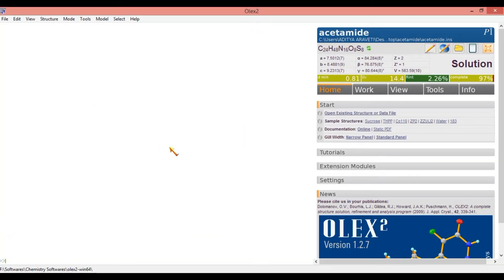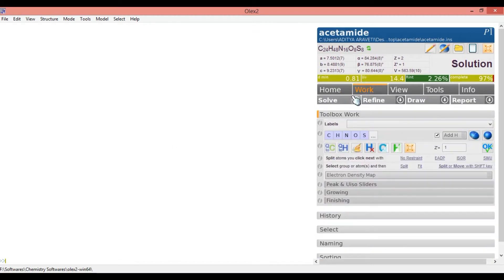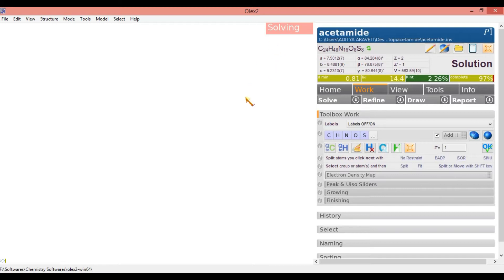In this, just click on the Work File. In the Work File, just click the Solve button. If you click the Solve button, there will be a process going on. Solving processing is going on. Afterwards, it will show some dots. Using the dots, we should identify where some atoms are.